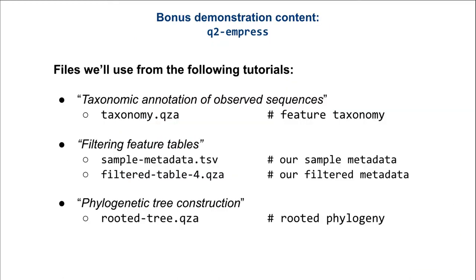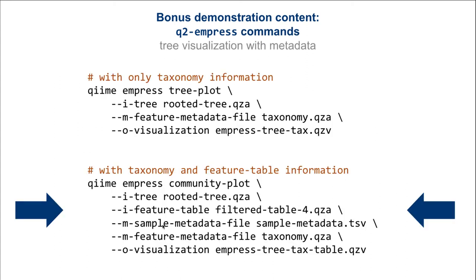Before we continue with the QIIME Empress demonstration via the command line, we will need a set of four files from prior tutorials. From the taxonomic annotation tutorial, we will require the taxonomy QZA file. From the filtering feature tables tutorial, we will need the sample metadata and filter table files. And from the phylogeny tree construction tutorial, the rooted tree file. Now, there are a couple of ways you can run Empress to generate a tree visualization. The first is the simplest approach you can take, where you can visualize a tree with its taxonomy. The command below, which is the one we'll demonstrate today, you can also add other information, such as your sample metadata and your feature table. Let's see what we can do.